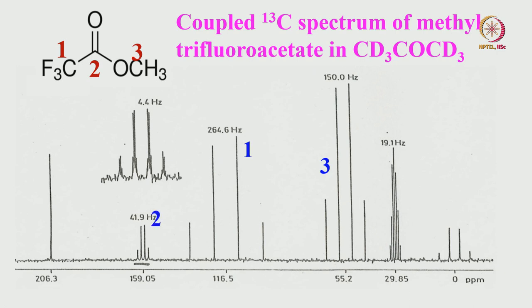If you expand carbon-2, you can see that each line of the quartet is itself a quartet—it is a quartet of quartets. That means this carbon is experiencing coupling with both the CF₃ group and the CH₃ group. The CF₃ fluorines give a large quartet of approximately 42 Hz, and each line is further split into a quartet because of long-range coupling with CH₃ protons. This is very clearly understandable. We can now make complete assignments.